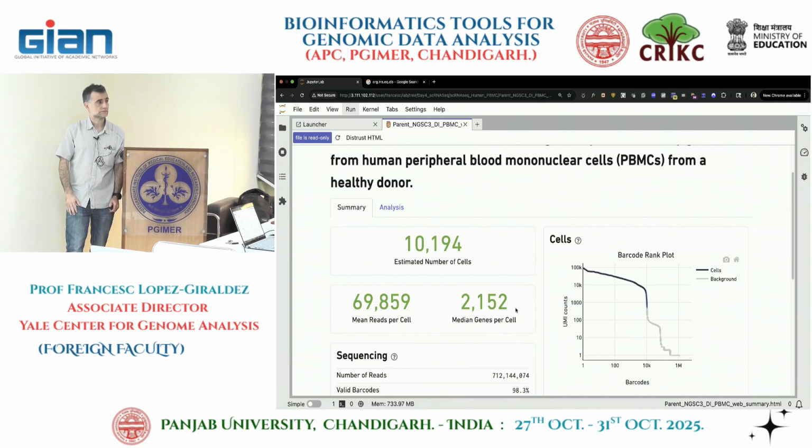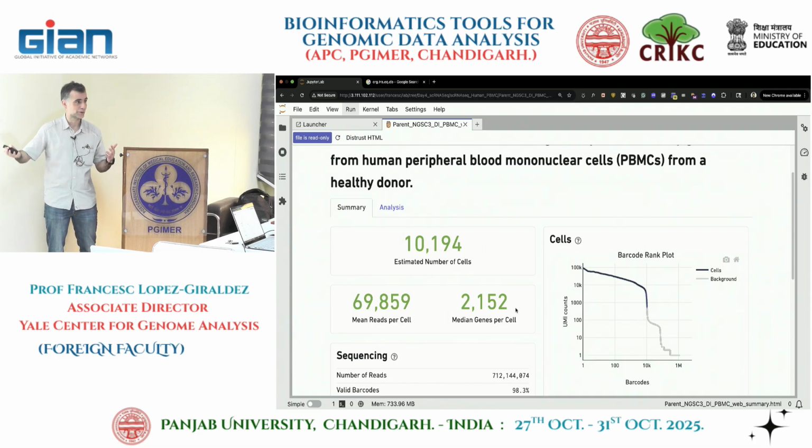So my question is, like, right now we are seeing that the graph is still 10K of the cells, right? Yep. The dark blue. So if it is less than that, that means the estimated cell number was less, or that much have not been sequenced. Yes, it's not a problem, right? Even though you're expecting 10,000 cells and you get 5,000, that's fine, right? I mean, it didn't work as you expected, but you still have some data that you can use. Meanwhile, this number is good. Meanwhile, there's nothing else down there that could throw your analysis out.